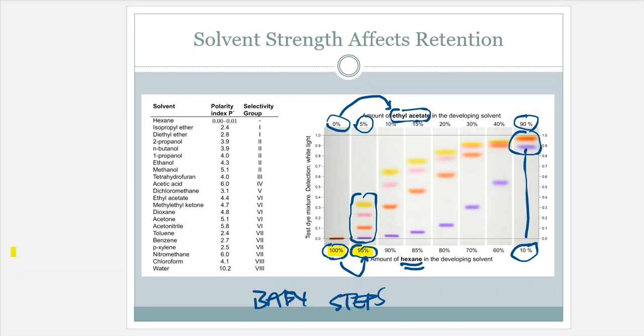So what's happening here is that everything left and everything approached the top. That is also not a good situation. We do not want something like that to happen. So what is the thing that we're after? Well, if you take a look at the one before, look at the yellow and the orange here. What happened to the pink? There was a pink one that showed up here, a pink one there, a pink one there. It is now disappearing into those bands again.